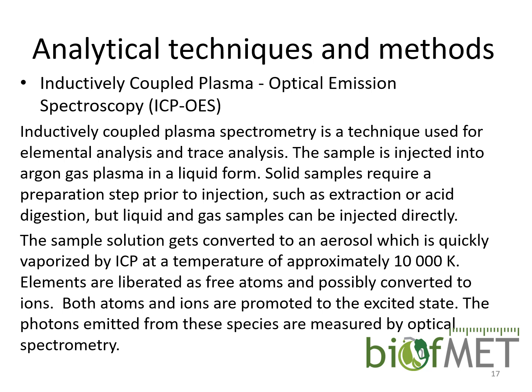ICP-OES is also one of the optical spectroscopy methods. The principle is similar to atomic absorption. It's only that here you don't record absorption of light at a certain wavelength, but you are actually recording the emission, the intensity of the emission at a certain wavelength. Also, the wavelength will tell you about the identity of the element, and the intensity of this emission will tell you about its concentration. Your sample is also in liquid form, and you also need to vaporize it, break it down, atomize it, ionize it, and so on.